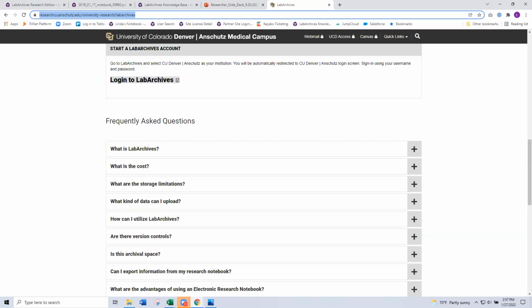So this next one here, Nicholas, is a longer one. You have experiments that generate CSV files in a standard format, .csv. You mentioned it'd be helpful if LabArchives consolidated these individual experiment .csv files into a single searchable data repository, so that you could have single consolidated files rather than, let's say, 100 individual experiment files. Is there a way to upload individual files in such a way that information is deposited in a secure database?